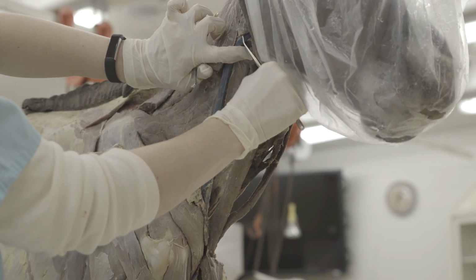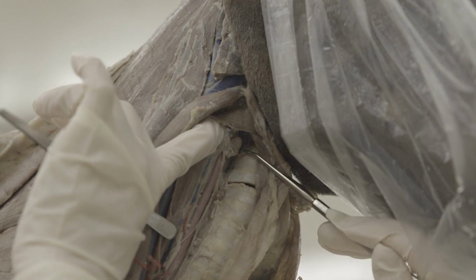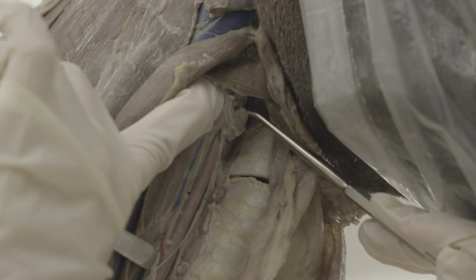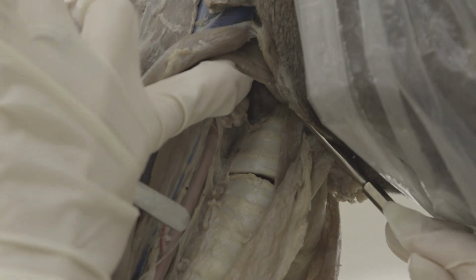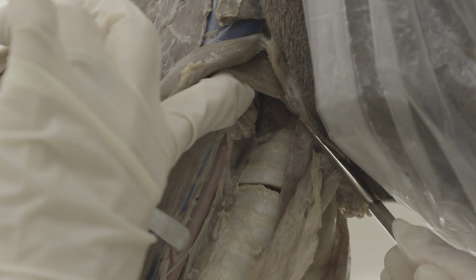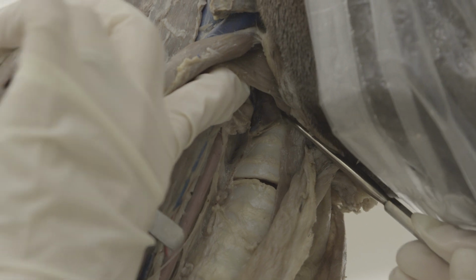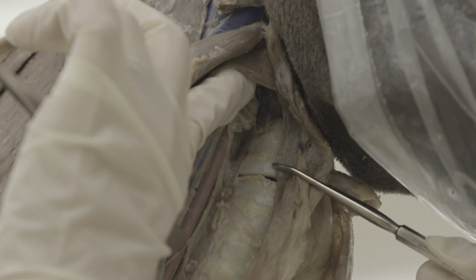closer look at that. So here we're just taking a closer look at the deep cervical lymph nodes. So these are the cranial deep cervical lymph nodes, this bunch right here. And if you go just cranial to that, you have to spread these muscles and try and get in there to see the thyroid gland. So this oval kind of dark colored mass is the thyroid gland right here, right next to those deep cervical lymph nodes here.